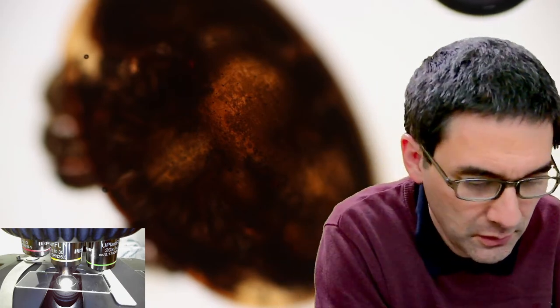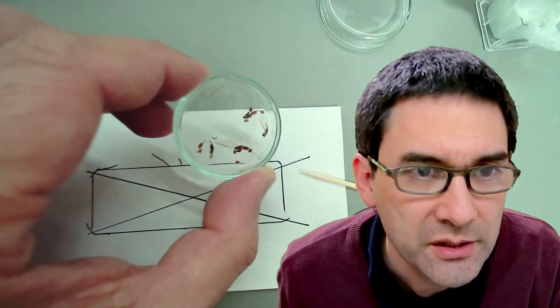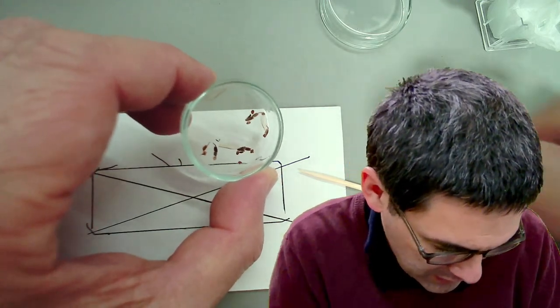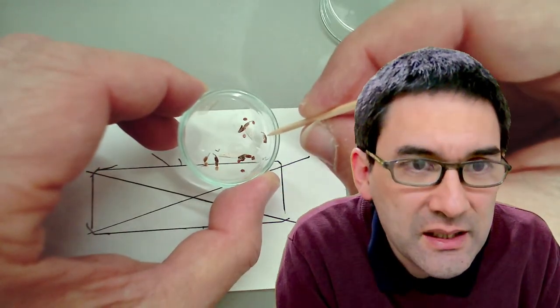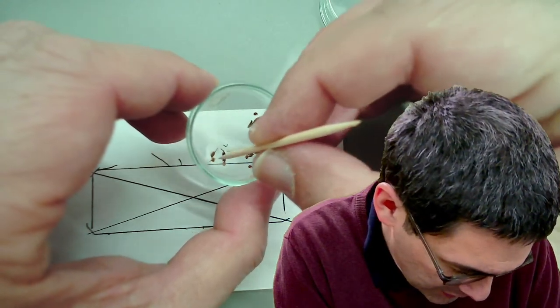Okay, so a rather difficult one because of its thick size are some bee legs and so on. Honestly, I don't think that this is going to, oh, here you see, I don't think that they might be a good one, but I think it must have been this one over here. Maybe it's this one. I think this is a stinger, but I was a little bit surprised. Or was it this one over here?